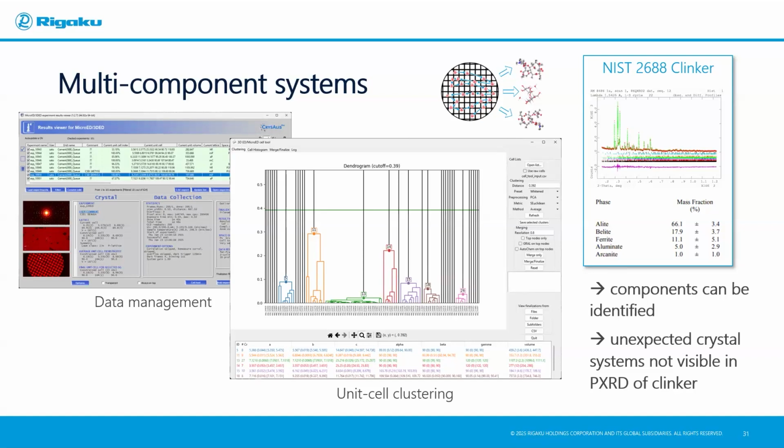With the automation, can the computer automatically come up with a path where it recenters after going through a range, or does it only center it and then figure out the range of the crystal?